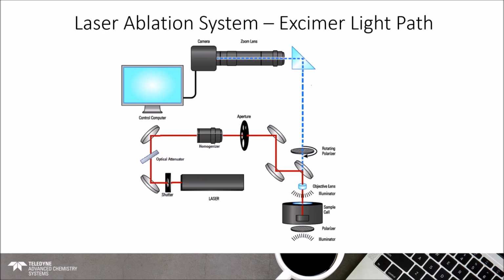It's important to remember that even though we're ablating the surface and what on a very small scale looks like basically an explosion occurring, it's all very well controlled, and you get a feel for that based upon just how beautiful the crater shapes are, and as I say, how true to being cylindrical and flat bottomed they are.